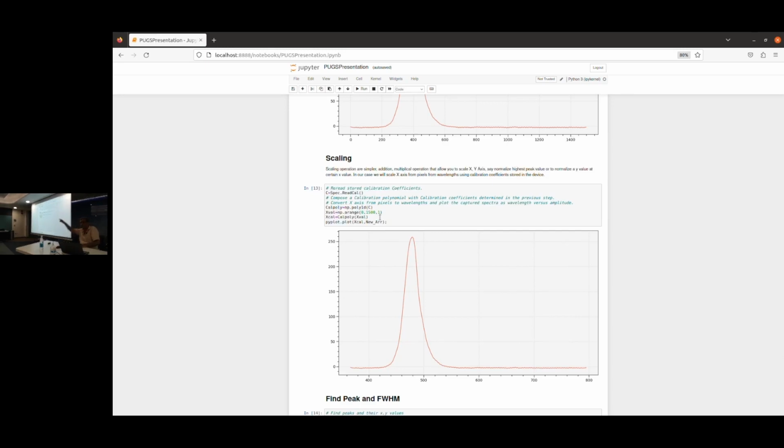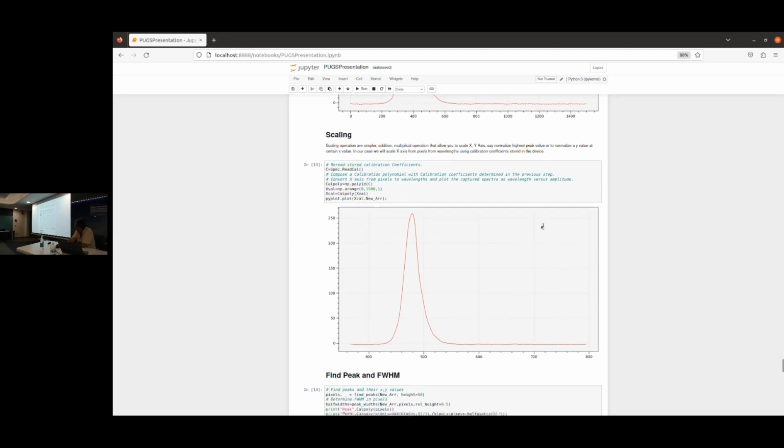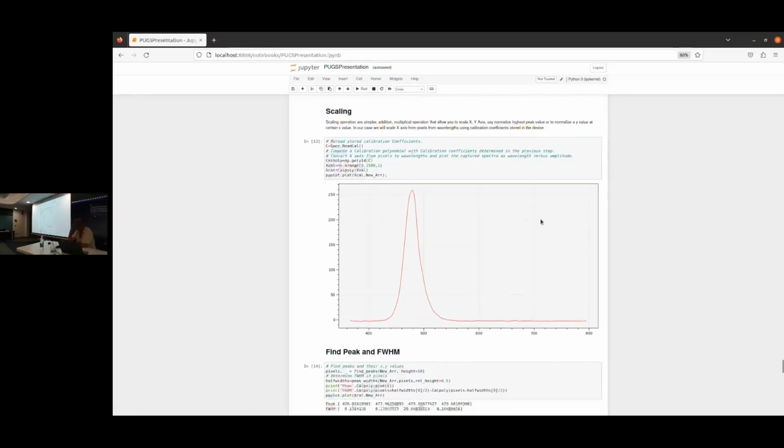It has some curvature that's available in the data sheet. You can adjust the y-axis as well, at least for the curvature of the pixels. Typically, you'll put a black body radiation and try to make sure you fit that black body curve and that temperature pretty accurately, but it's a lot tougher on the y-axis.